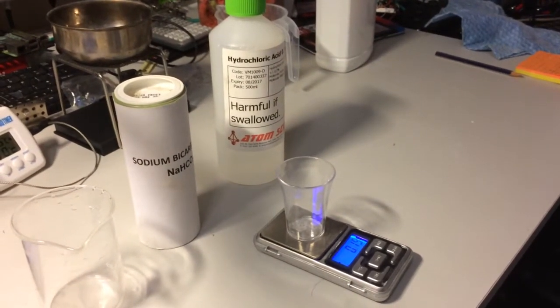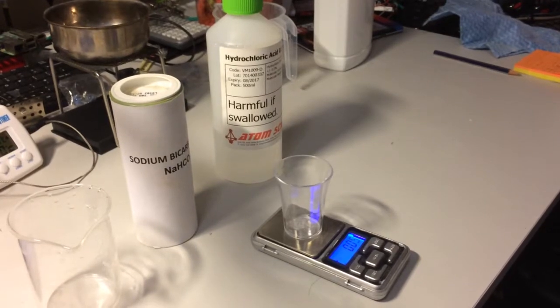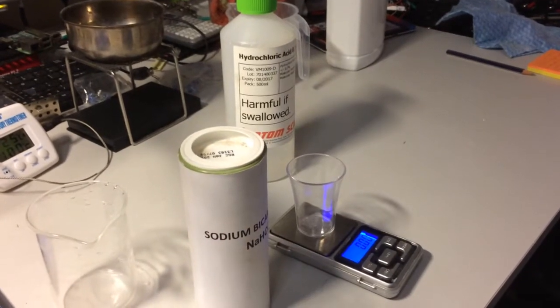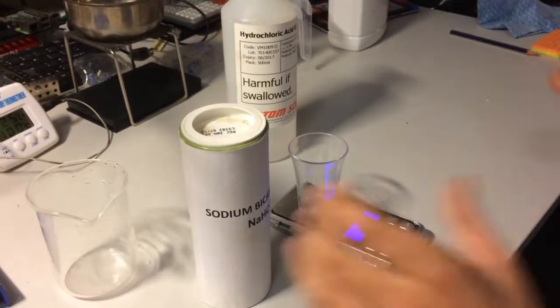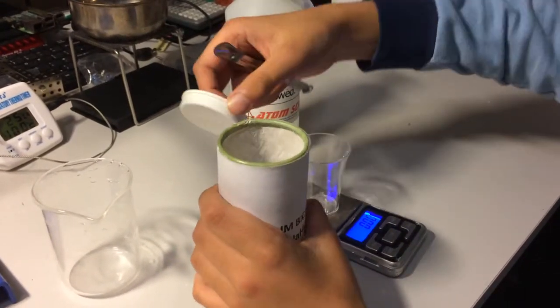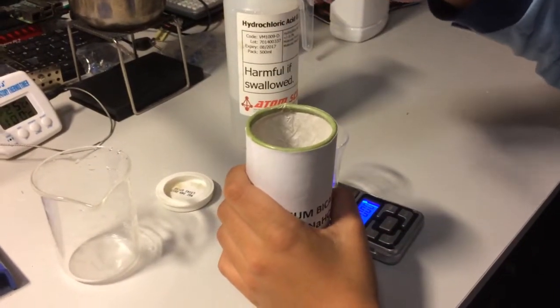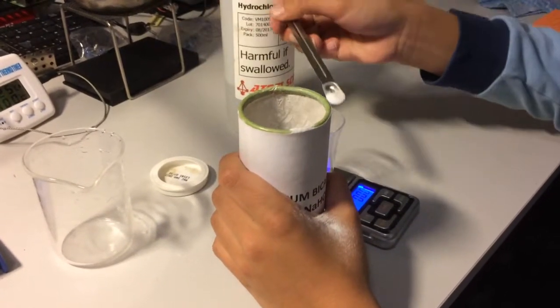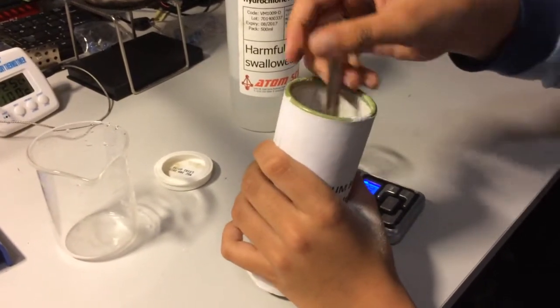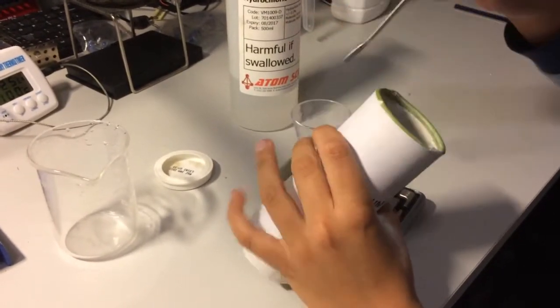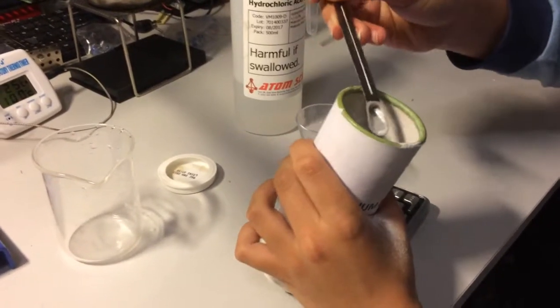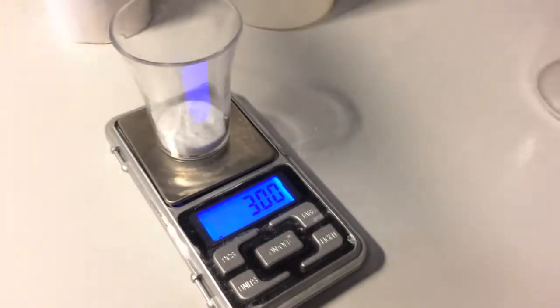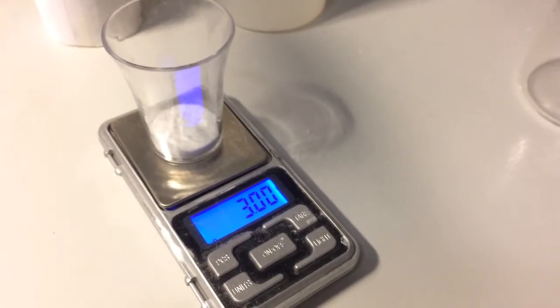Firstly, we will need to measure amounts of these substances. We'll start with the sodium bicarbonate and its formula NaHCO3. This is also used for cooking. Now as you can see, we have 3 grams of sodium bicarbonate.